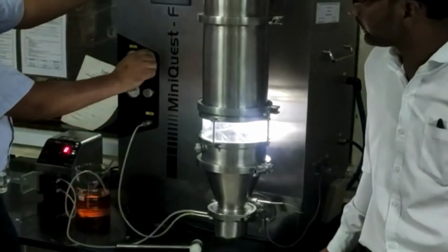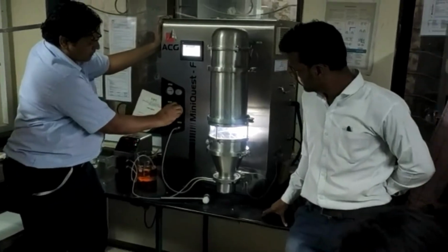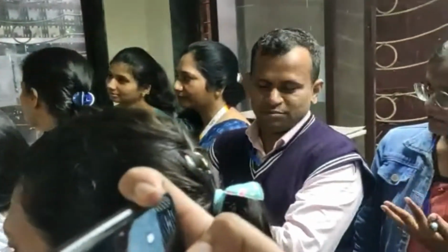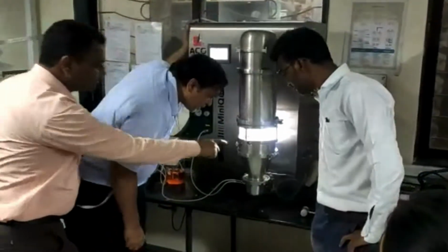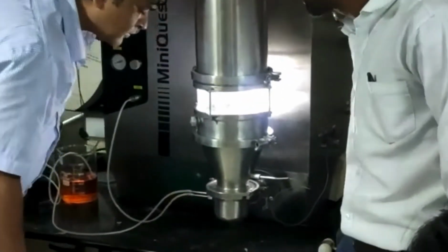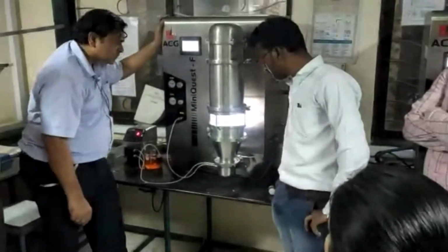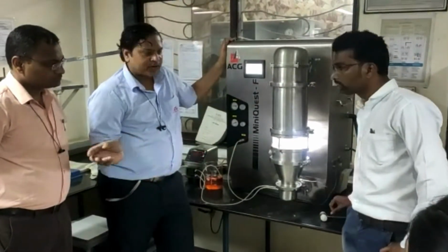Generally, it is not we will be remove this pellet and we will add another dry pellet.